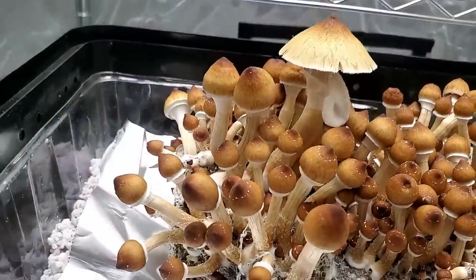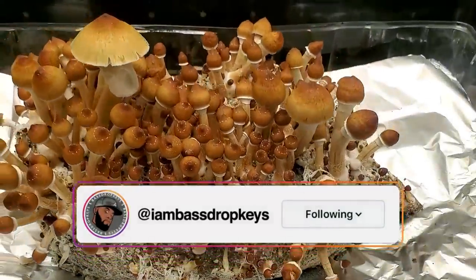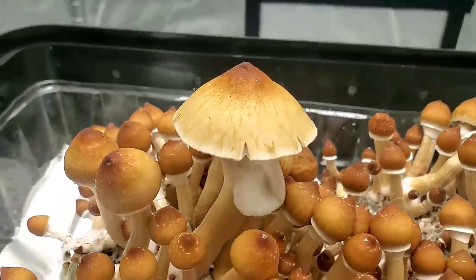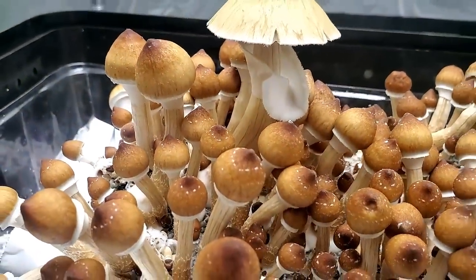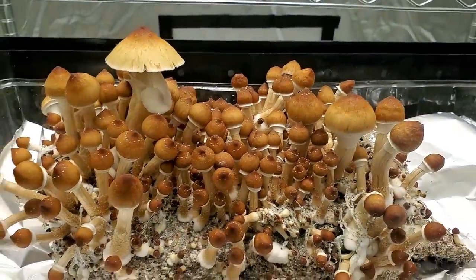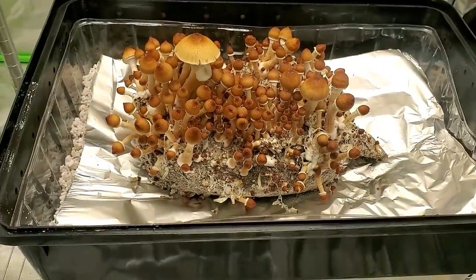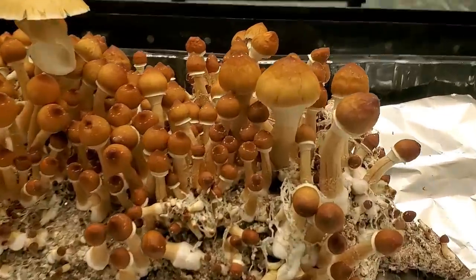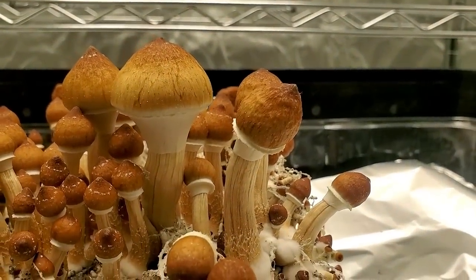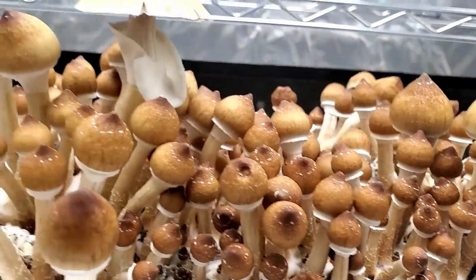Yo, what's good rookies — Bass Drop Keys, your friendly neighborhood rookie mycologist. In today's video I'm going to be doing spore print and spore swab to agar. Make sure you stay till the end of the video if you want to see an update on the uncle ben bags, the all-in-one grow bag, the north spore grain bags that I inoculated, and the agar to agar and agar to grain spawn that we did on May the first.